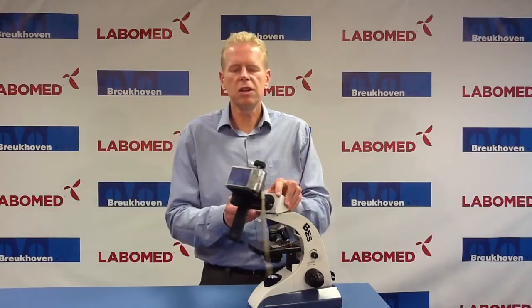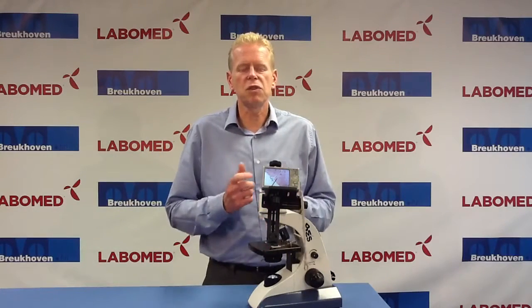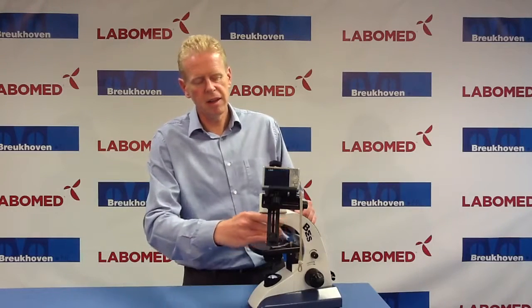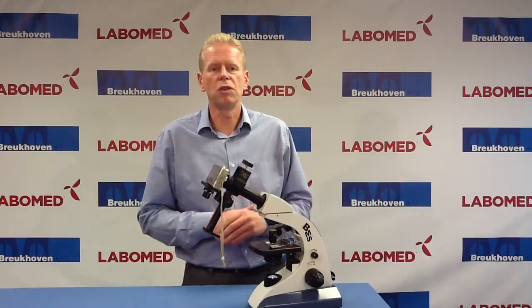As you can see you directly have a fine image of the exact image which you will normally see through the eyepiece. It's also par-focal. I'm now showing to you the 4x objective. This is the 10x. And this is the 40x. So like this, a very nice way to hook on your camera. Thank you for your attention.